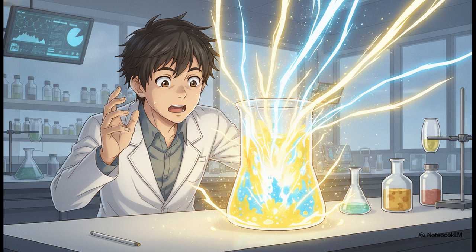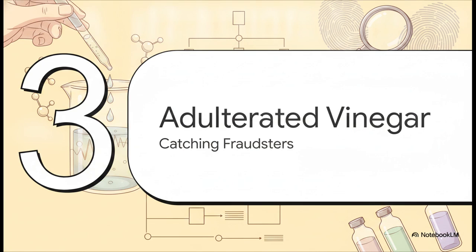This increase continues right up to the equivalence point, the exact moment of complete neutralization. Beyond that point, the conductance shoots up even more rapidly. Why? Well, because we're now introducing an excess of highly conductive, really fast-moving hydroxide ions, or OH-, straight into the solution.